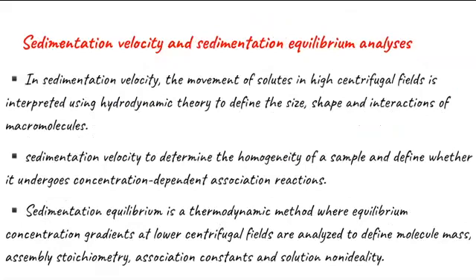Sedimentation equilibrium is a thermodynamic method where equilibrium concentration gradients at lower centrifugal field are analyzed to define molecular mass, assembly stoichiometry, association constants, and solution non-ideality.